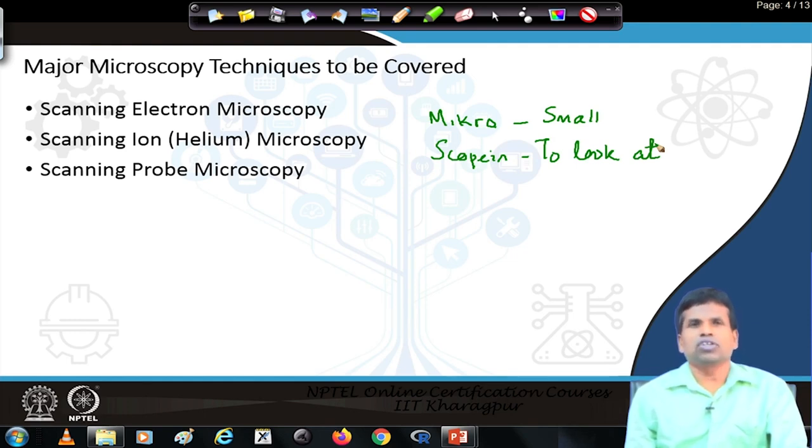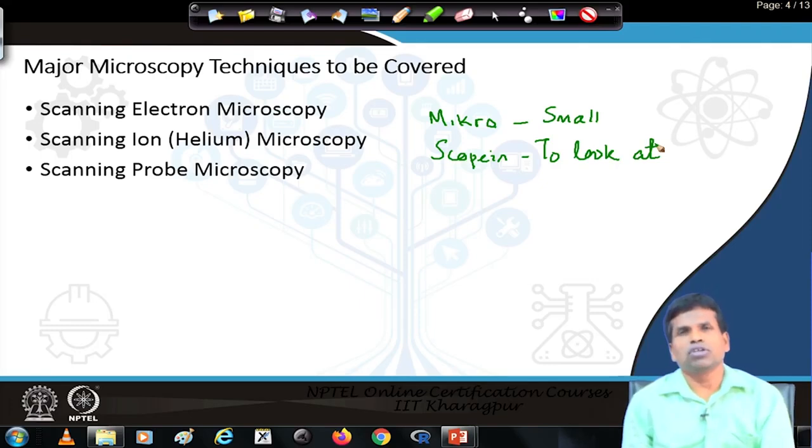Though the light microscopy is used extensively in pathological laboratories to see objects which are a little bigger or in the range of the wavelength of the light, we extensively use electron microscope to see the objects of much smaller size that we cannot see by the light microscope. So, the middle word is electrons here. If we use electron beam to see an object, then that is called electron microscopy.